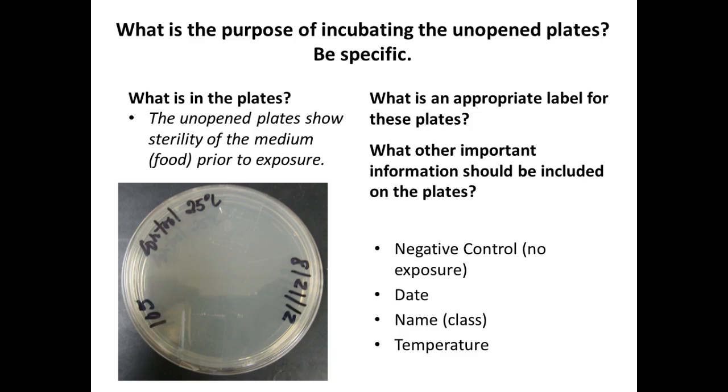Otherwise, someone could switch the lids on us and really mess us up. Same is true with our tubes. We label the tubes, not the caps. The caps could be switched. The lids could be switched. Typically, we write along the edge so that you can better visualize the growth on the plate. I didn't have you guys do that today. It's not a big deal.